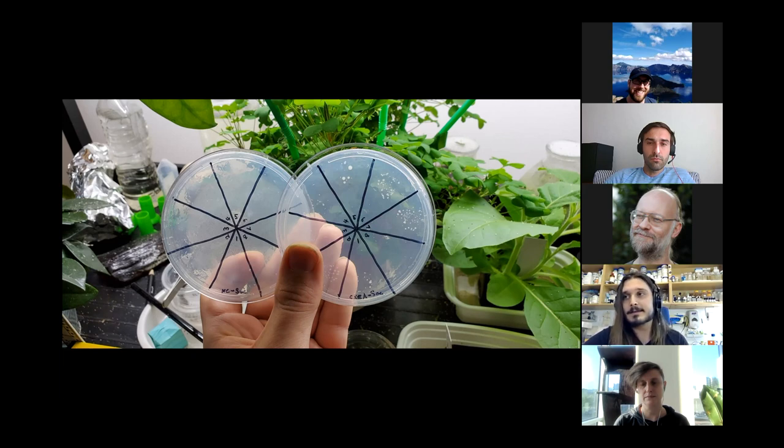Let's say it's not legal to do genetic engineering at home, like it is in many countries. In a school, there are many ways to get permits to do so, but then you can't buy ampicillin and kanamycin. You have to revert to shady dealings with strange people. And I wouldn't want that, right? So we're working on ways to import the sucrose pathway, the permease as well, to make this more robust, such that in the end, all you need is super cheap minimal media and sucrose as a means of maintaining plasmids, right? So genetic engineering minus the antibiotics.